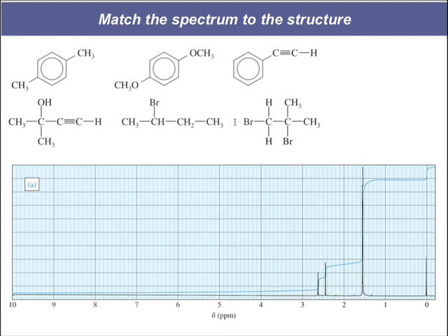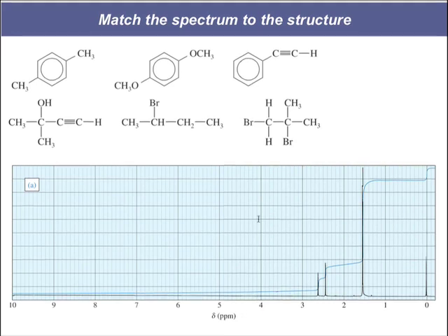And we've got these hydrogens way over here. These 3 over here should be very similar to these 2 over here because of their proximity to the bromine. But these guys have a methyl group on them. So that's going to change their environment. So we've got 4 different environments here. And we've only got 3 signals on our graph. So that doesn't work either, which means that this one better work.